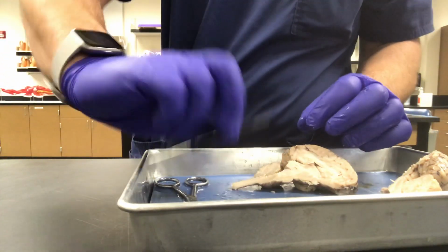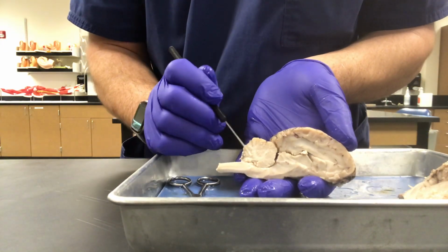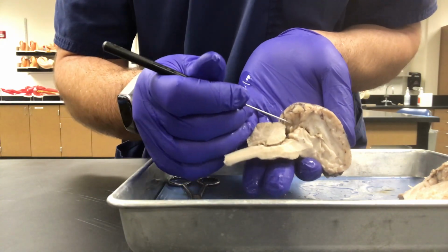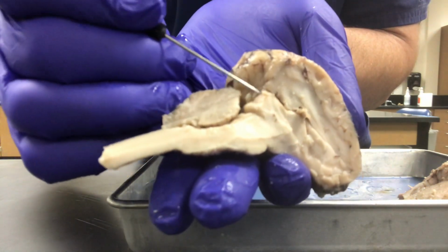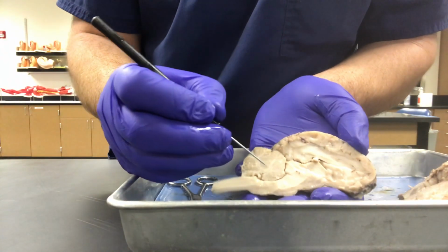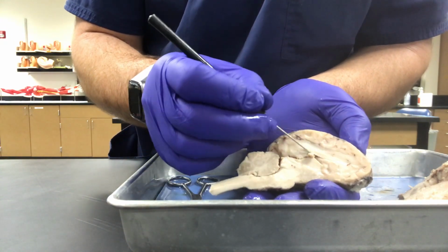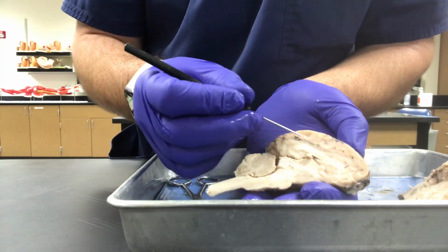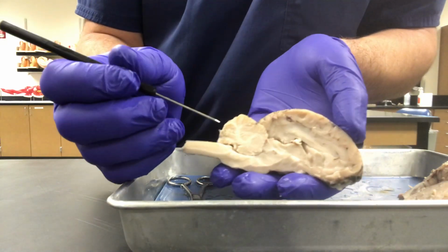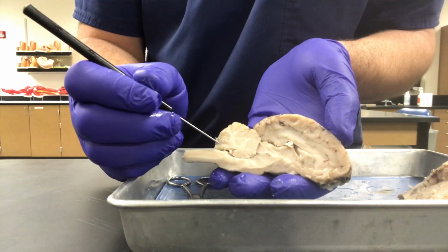Okay, so now that we're inside the brain, here are things that you can still see and identify. So this was the cerebellum, this little part that hangs back here. You can still see part of the corpora quadrigemina right there, 1 and 2, superior and inferior colliculi. Inside the cerebellum, we have all this white matter. You can see how it's more whitish. And inside the brain, you have all this that's whitish, and you have this grayish. That's called gray matter, and the whitish stuff is called white matter. And we'll go over that inside the notes. But inside the white matter, inside the cerebellum, this is called the arbor vitae.